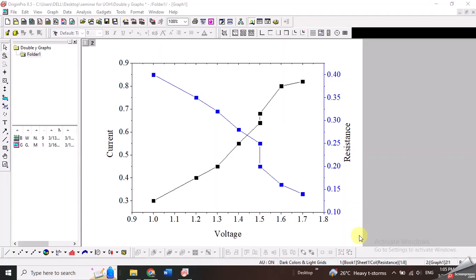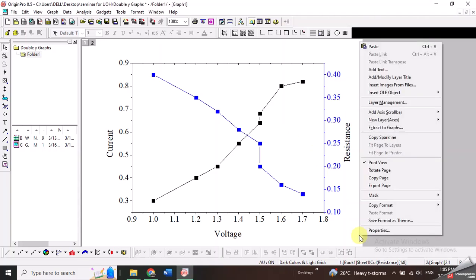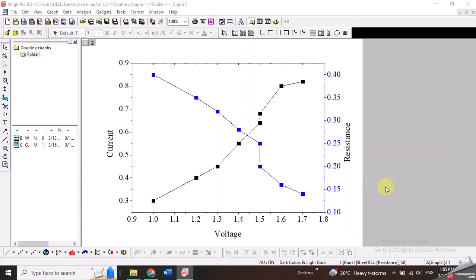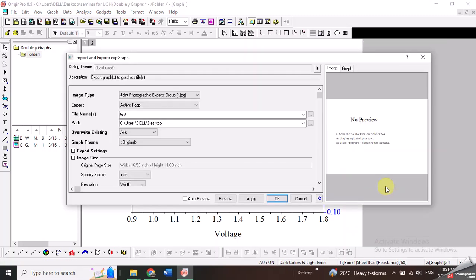So first of all you have to right click at the corner of the page and then go to export page option. Once you click it a window will open with certain options.